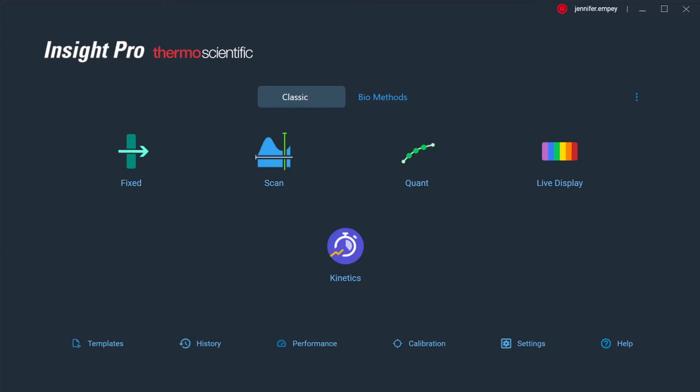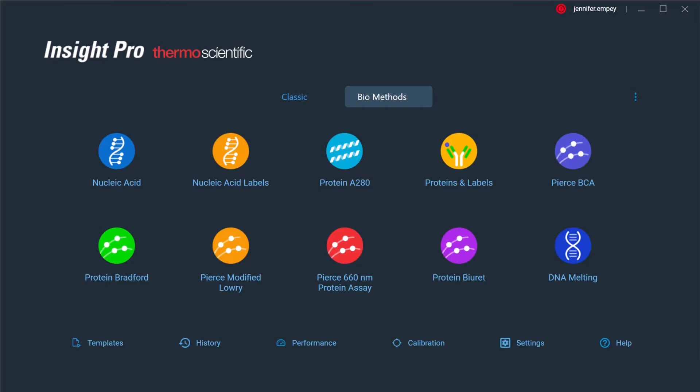Insight Pro software includes several experimental methods including Fixed, Scan, Quant, and Kinetics. The collected data can be reported in a variety of formats including absorbance, percent reflectance, percent transmission, and many others. In addition, there are several presets designed for common biological assays and methods.